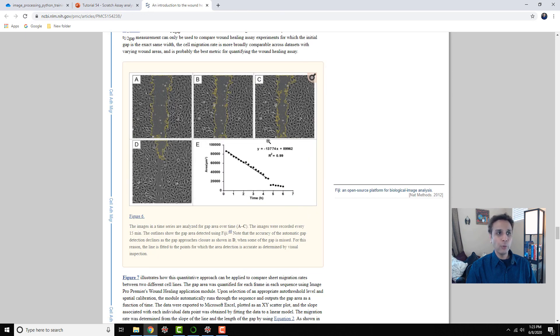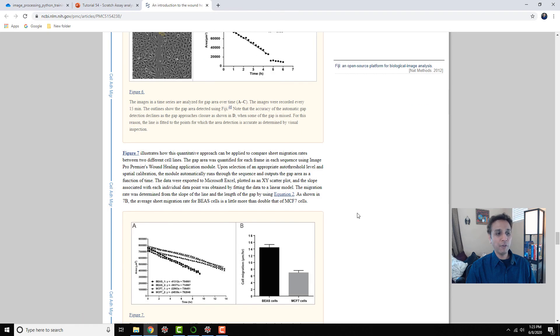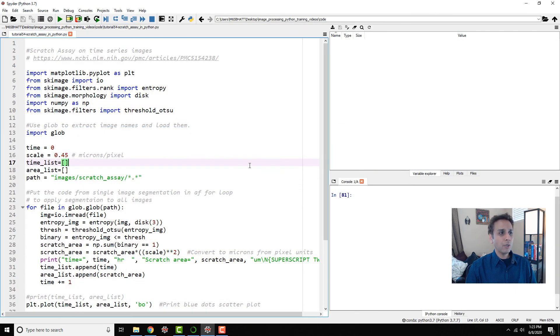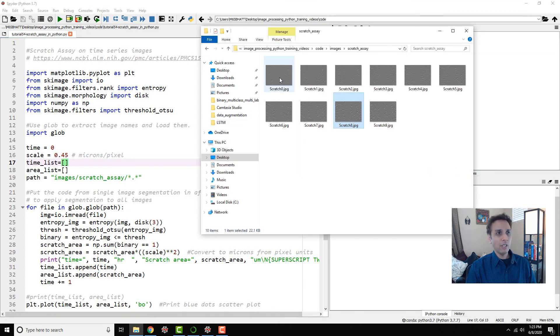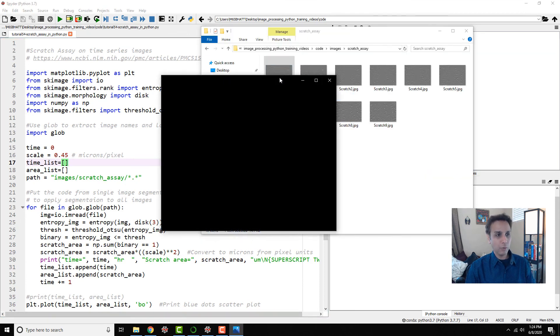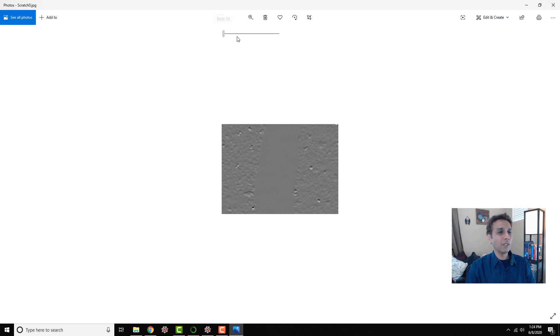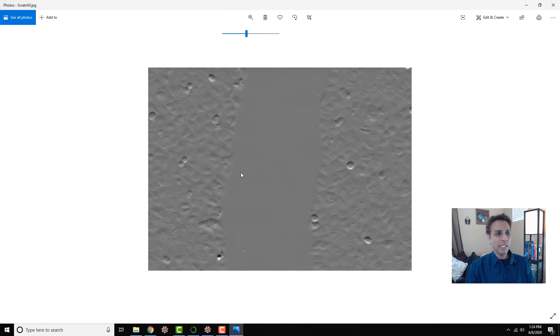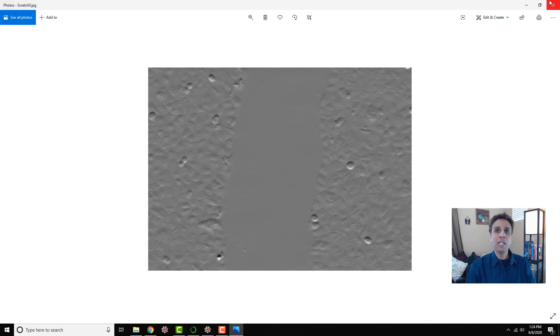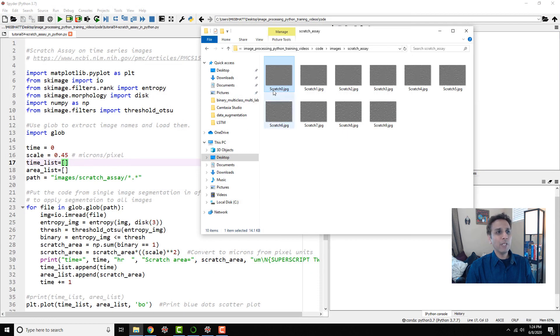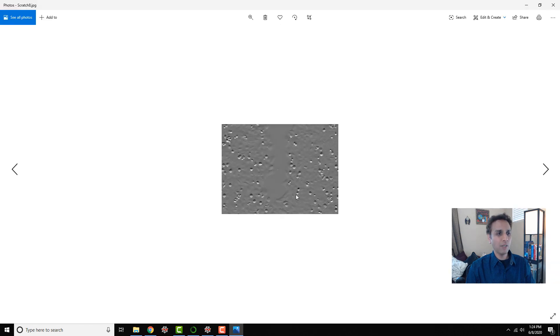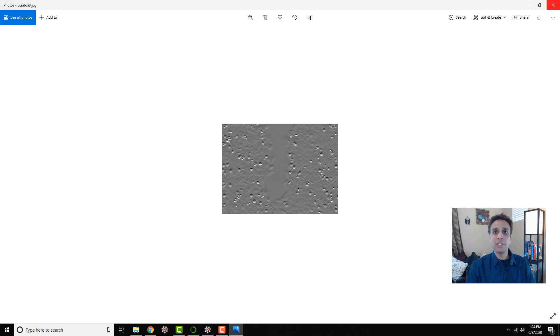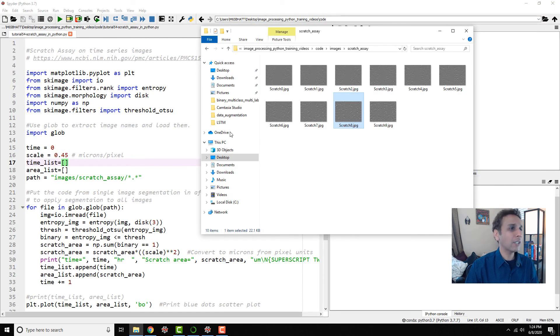I'm going to show you how to do pretty much the same thing using a few lines of code. Let's jump into our Spyder IDE. I have a folder with a few images with time equals zero. You cannot use histogram to separate this region from this, so we have to use a texture metric to quantify that region. We have images after a few hours and you can see how the gap is closing.